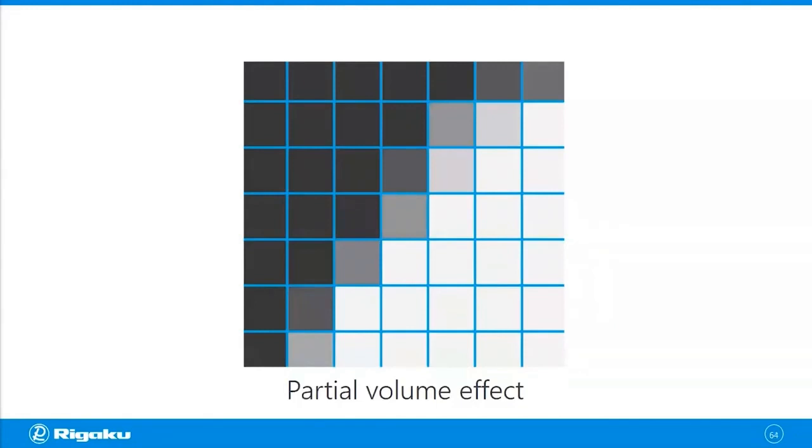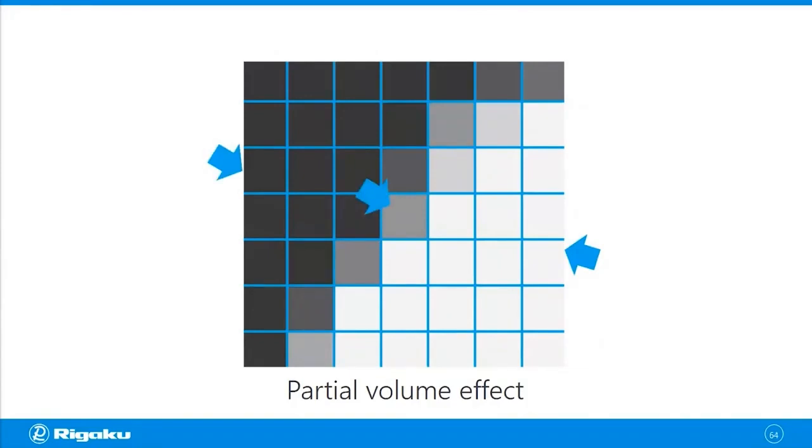Now after observing this image with a limited size of voxel, you end up having the white phase, the black phase, and this kind of artifact gray phase. And this is what we call the partial volume effect.